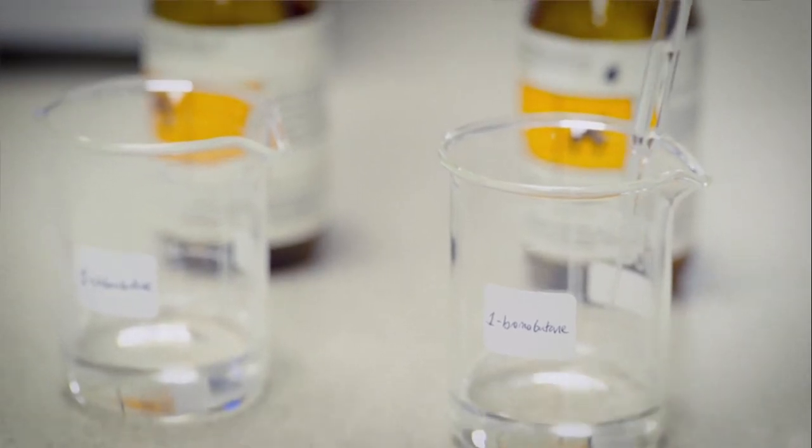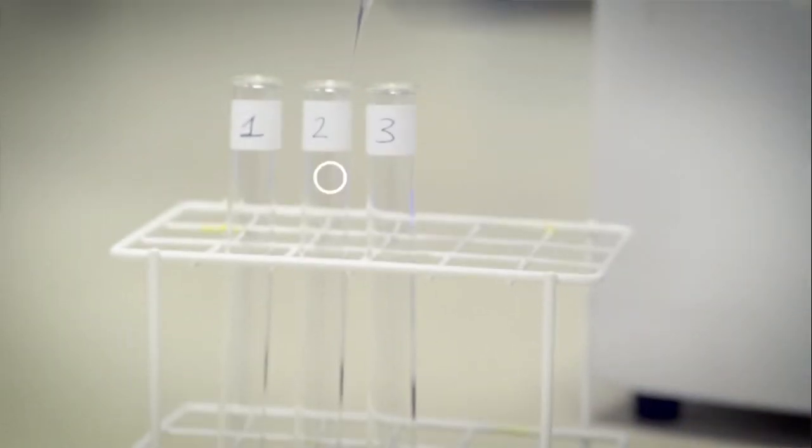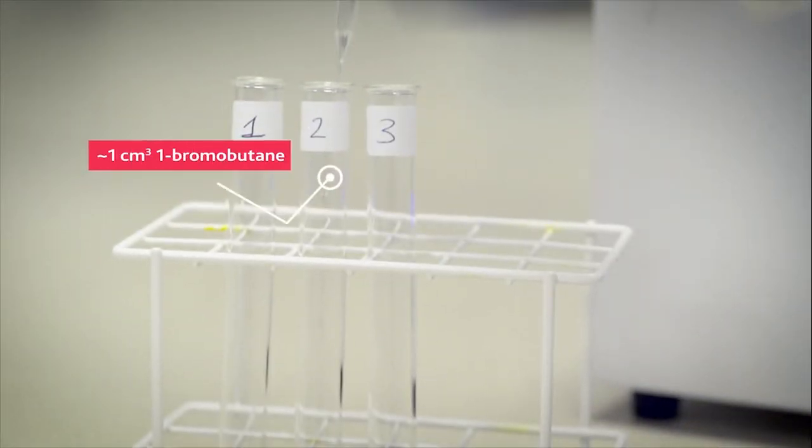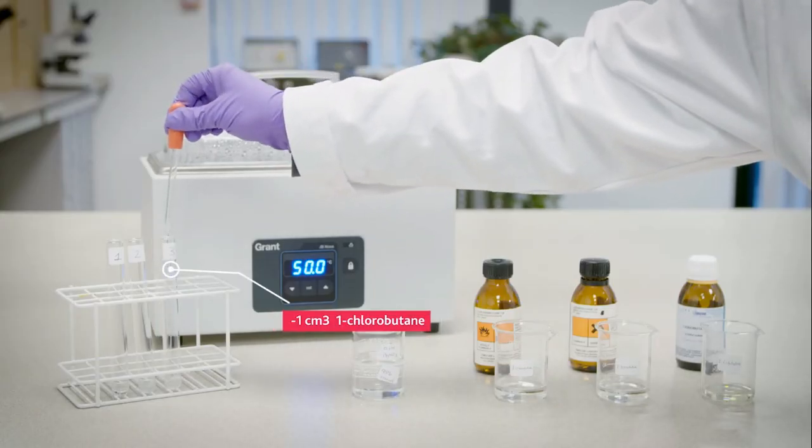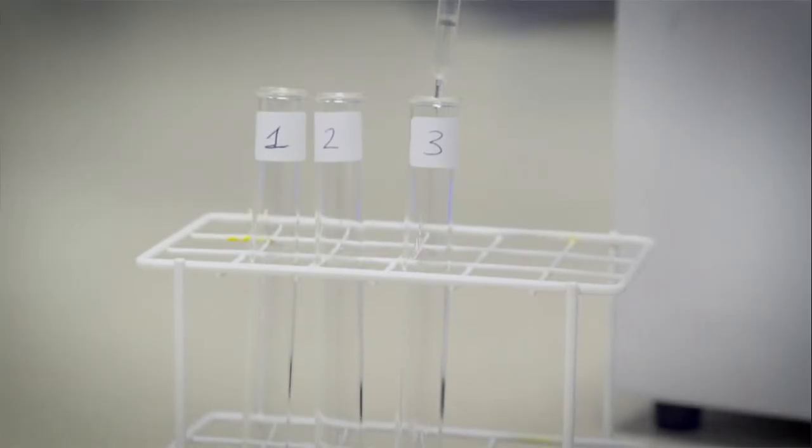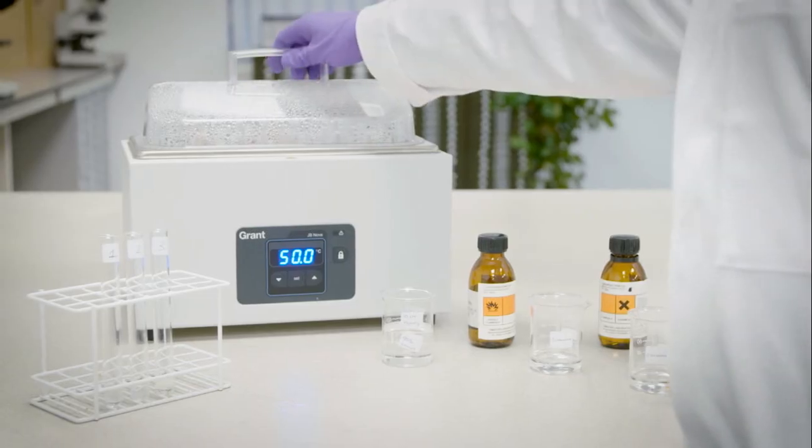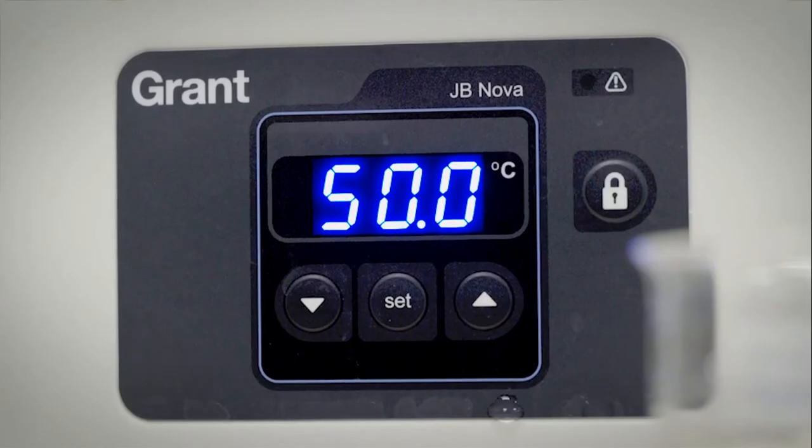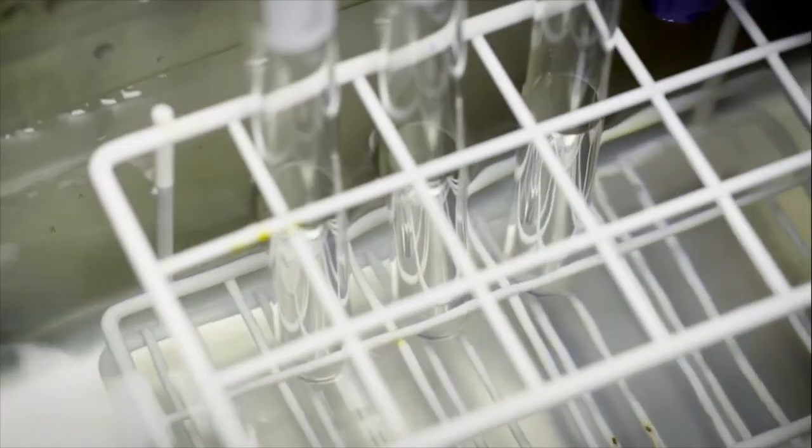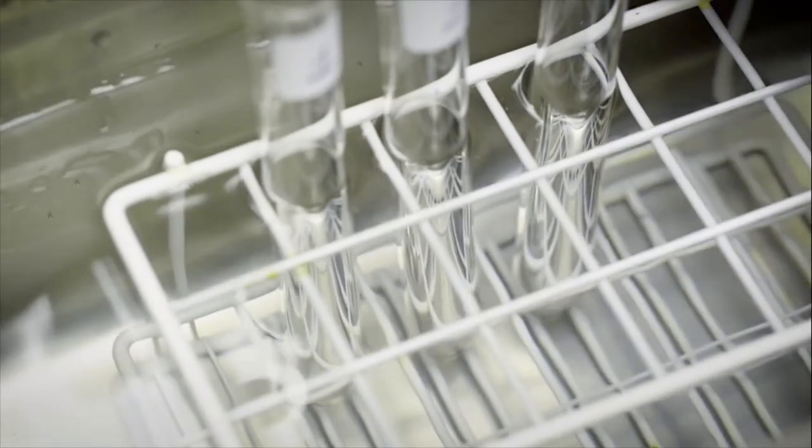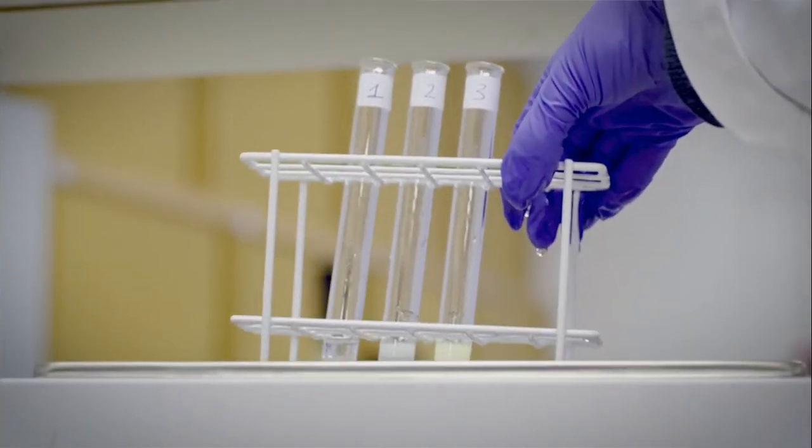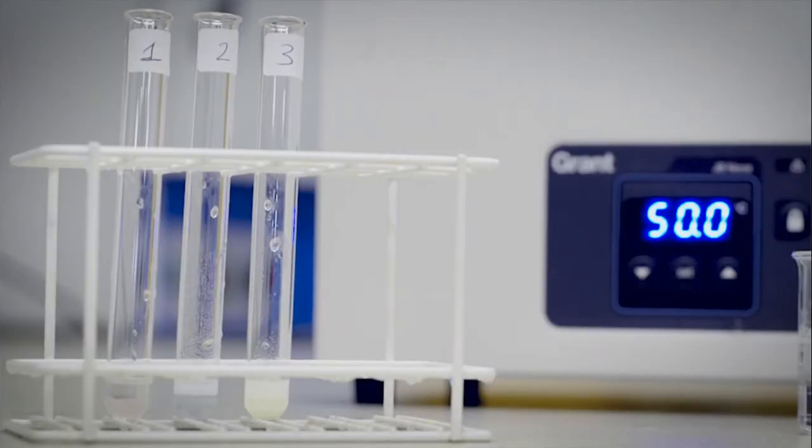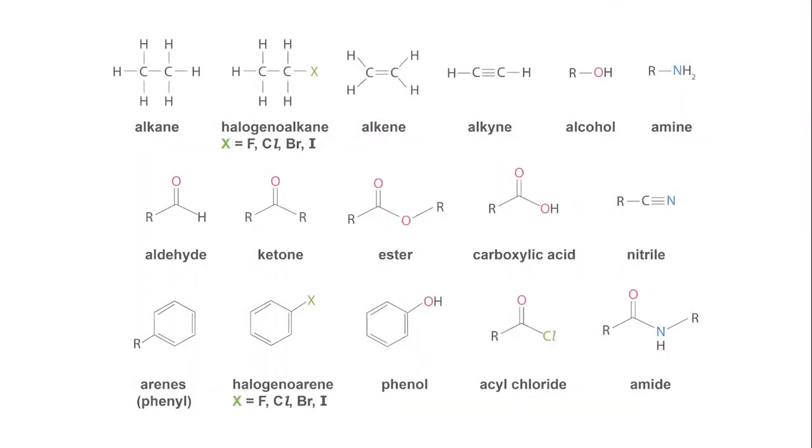One bromobutane is added to test tube 2. And one chlorobutane is added to test tube 3. The test tubes are then placed in a water bath set at 50 degrees Celsius. The contents of each test tube should begin to change. In a relatively short period of time, the precipitates observed in each test tube indicate the presence of a halogen atom.